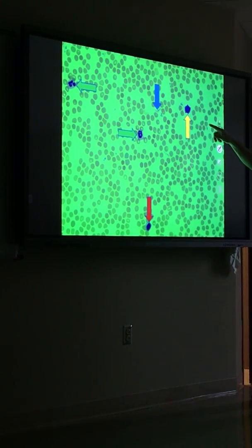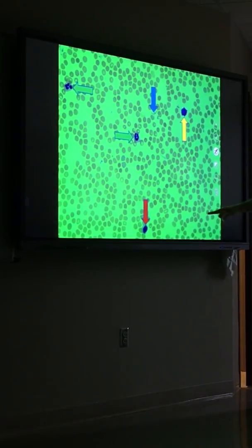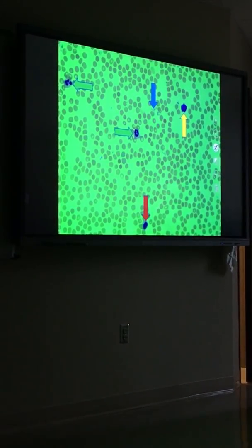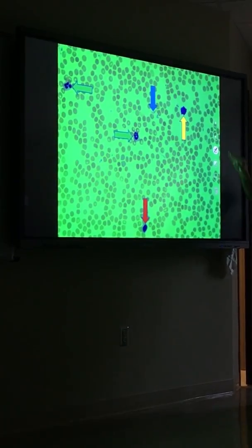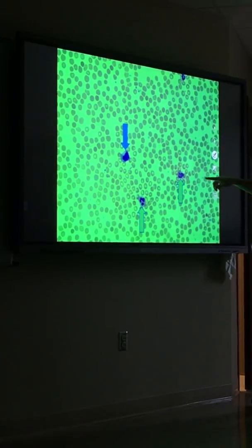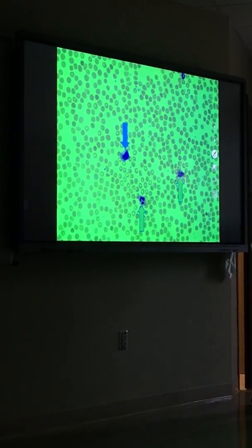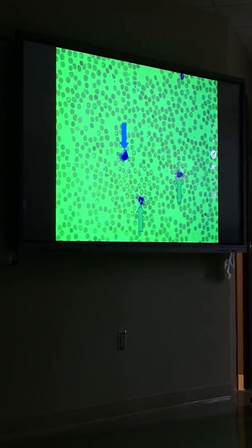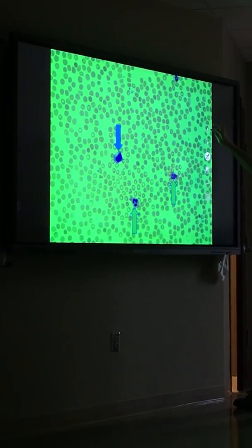Okay, basophil, my favorite one, probably the test one. Platelets, neutrophils, and another lymphocyte. Lymphocytes are a perfect circle with a drop of cytoplasm, right? Okay, neutrophils and probably another that's a tough one. That's probably another monocyte. Looks a little bit bigger than the lymphocyte.